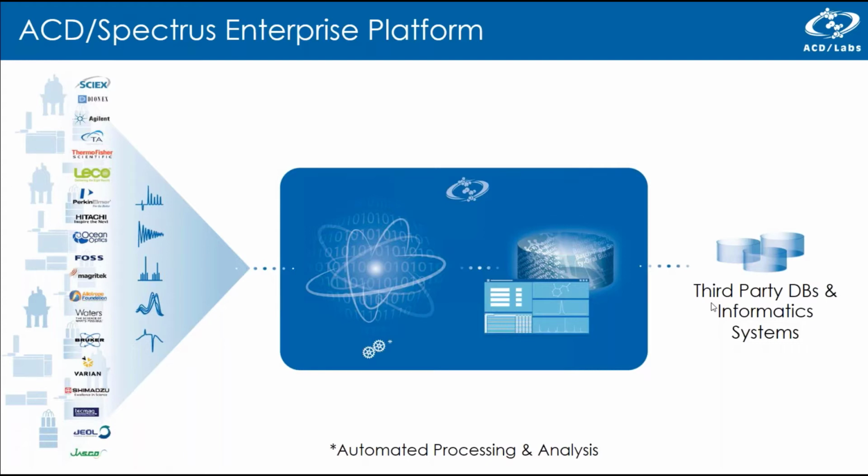And again, when you're going through and really deciphering and looking at Luminata, it fits the portion where people aren't doing this within their current systems. Just because LIMS and notebooks weren't built upon looking at control strategies, but having the capability of linking that information or that project, that process and stage to particular batches being quite crucial for our early adopters.